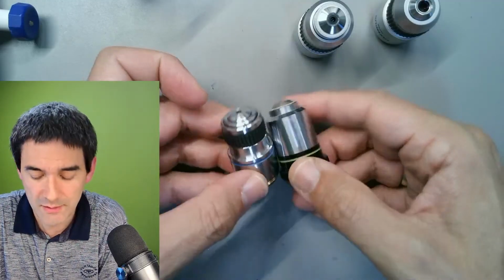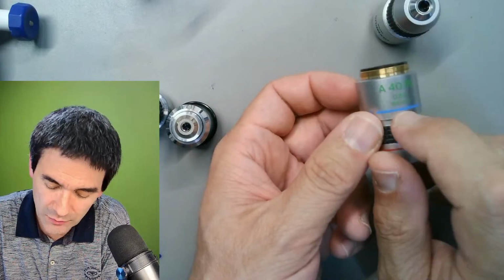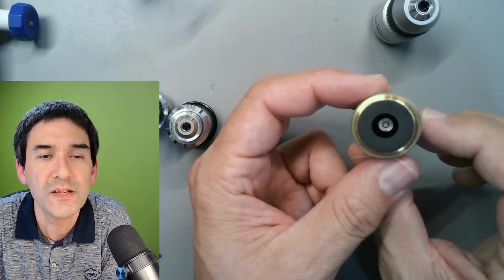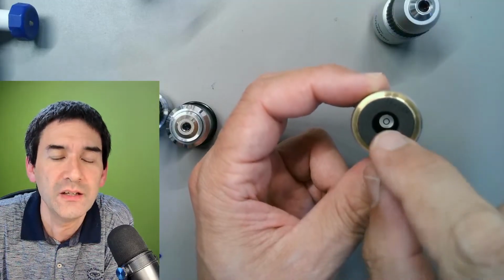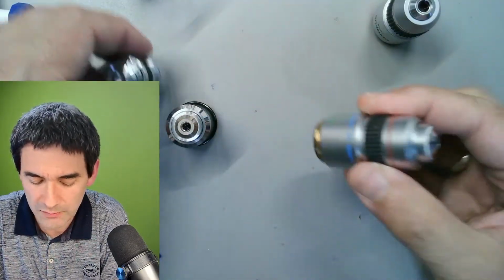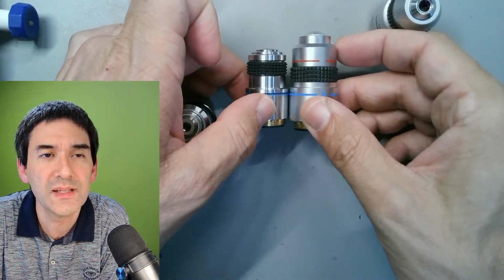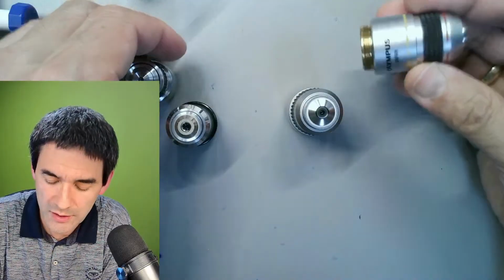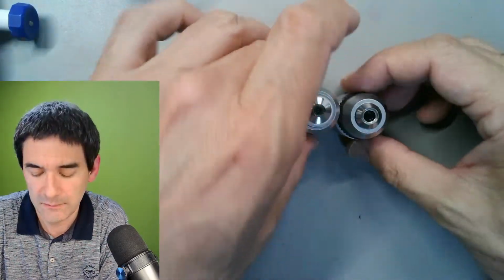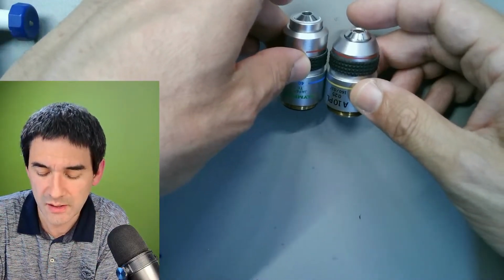Almost the same size. And over here, I've got another 160 millimeter objective. That's basically a phase contrast objective. You see this ring in here? It's a phase contrast. It doesn't matter. It's a 40 times. Look, much bigger. As a matter of fact, approximately a centimeter bigger. And over here, this one is also a 160. It's a little bit smaller here, because it's a 10 times, but it's also bigger.